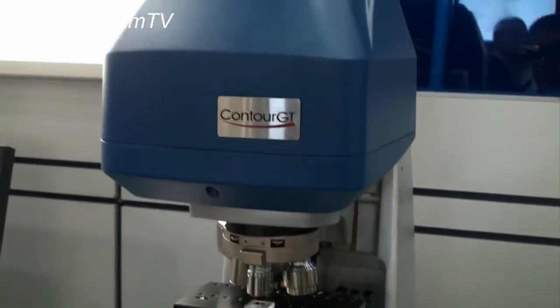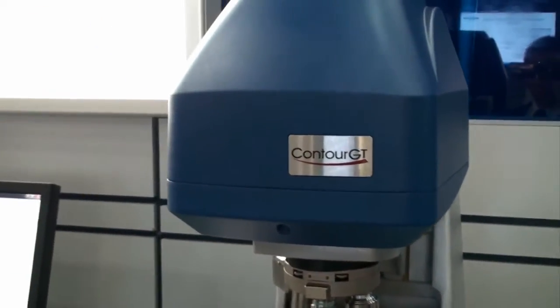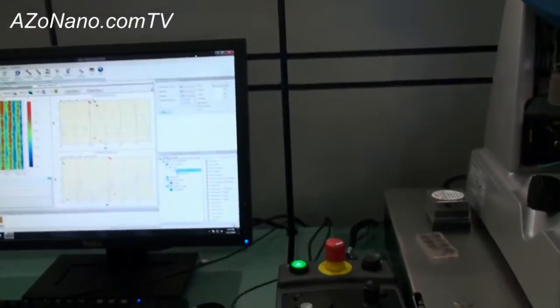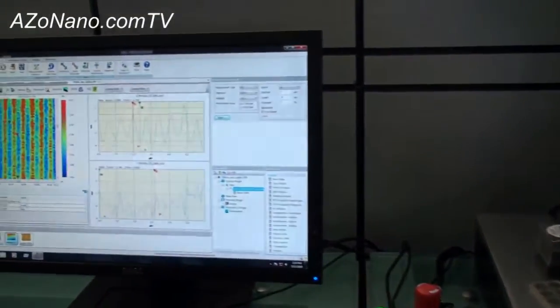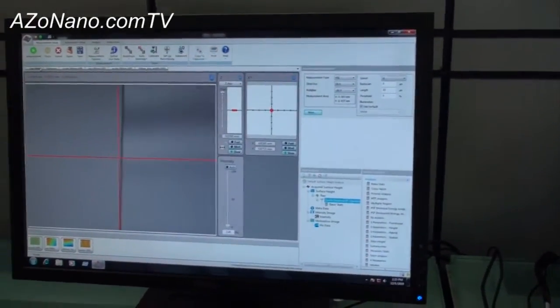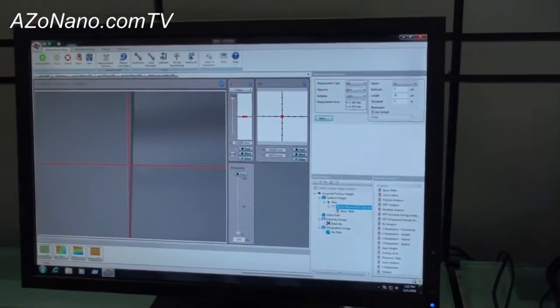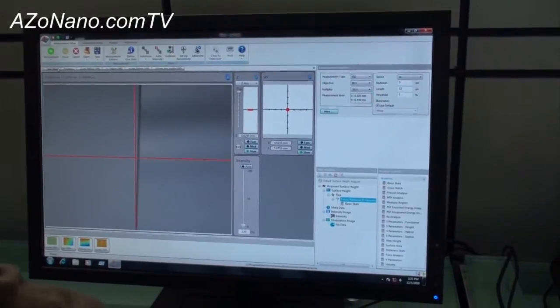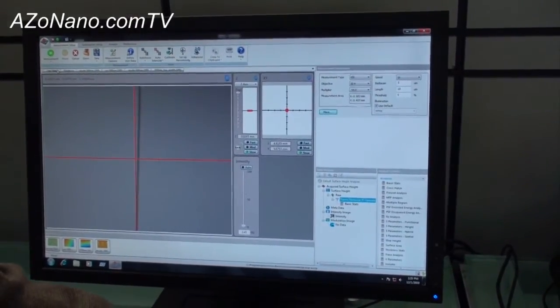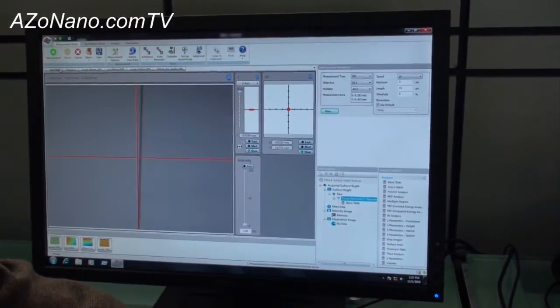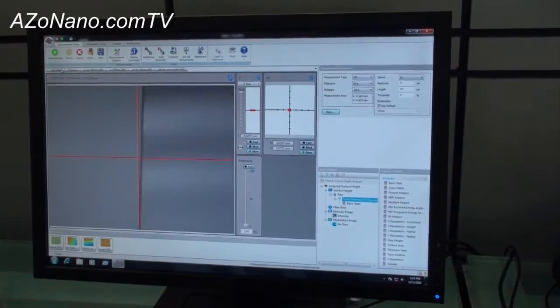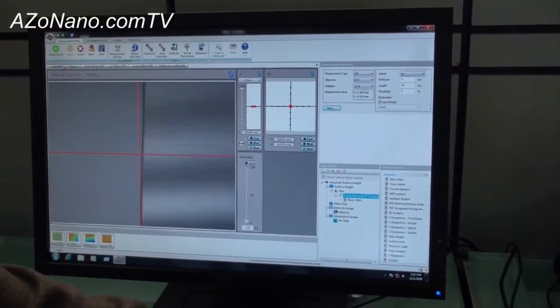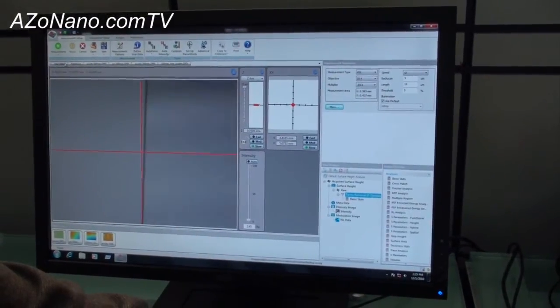I'm going to take it over here to the software and we'll actually make a measurement now. So this is a real simple thing that we're going to measure. This is what the live video looks like. To operate this system, what we would do is focus using our focus knob until we see fringes on the surface. There's our interference fringes.